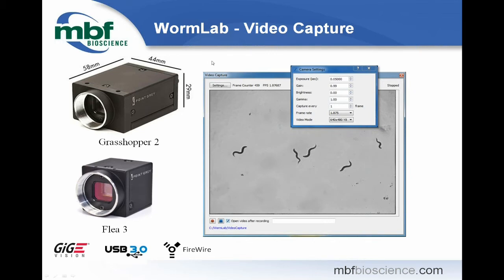We have a video capture window, and we have these camera settings where you can adjust the exposure, the gain, and the brightness. You can set the frame rate. We have this option as well where instead of capturing at a continuous rate, you could capture every 10th frame or every 100th frame for time-lapse captures over a long period of time.